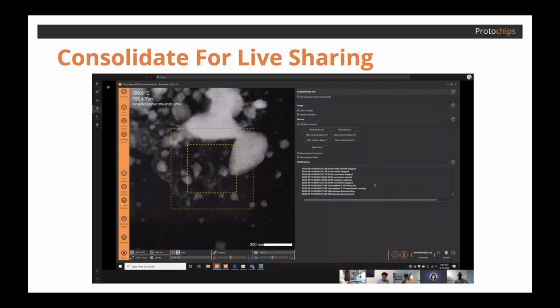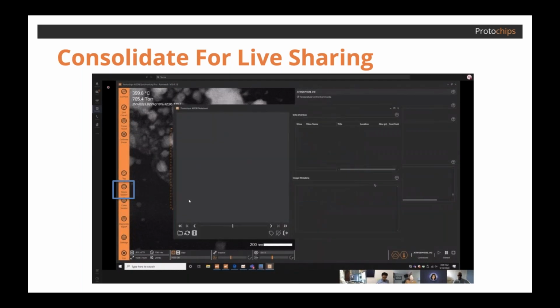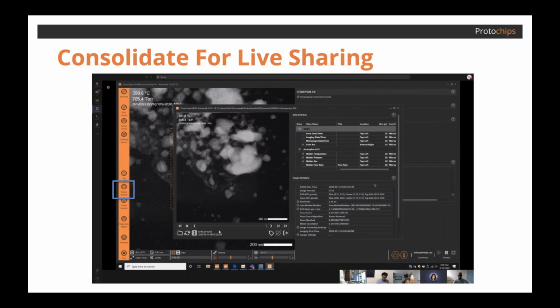Now again, after a few hours of experimentation, it becomes easy to lose the big picture of what's already occurred. And so when the question pops up, do you have what you need? The TEM operator can do an on-demand data review of everything that's been captured, so that the audience can be reminded and have a clear idea of where the experiment stands before the session continues or ends. You just click Review Session on the dashboard, and then the AXON Notebook app pops up with all the data loaded in it.